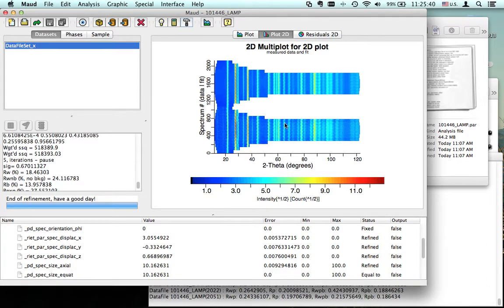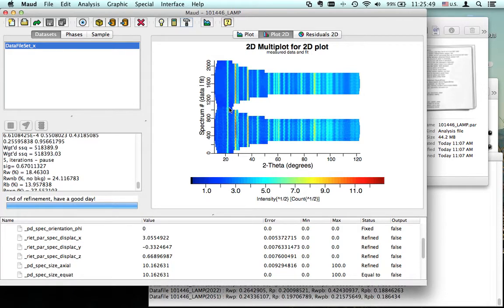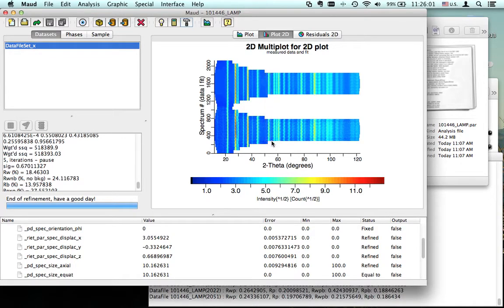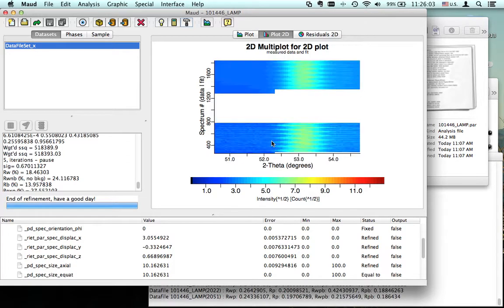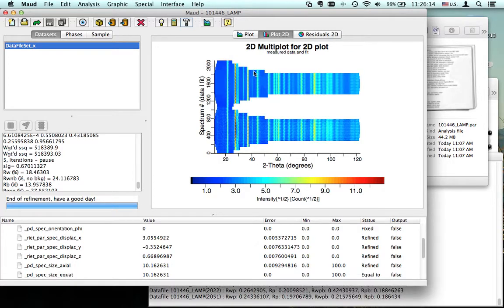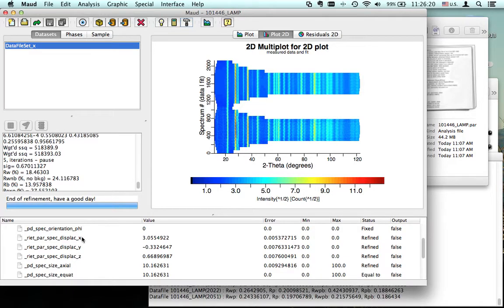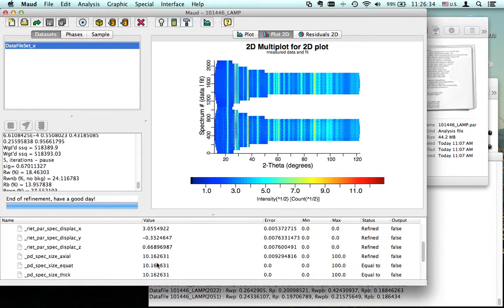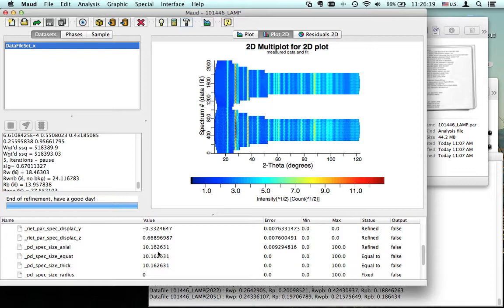It's sufficiently good because we have nearly one thousand patterns. If you check over here, let's check for the waviness. Now you see that we are correcting exactly for the waviness, and even the out-of-sample is going a little bit out. If you look at the final parameters, there was a big displacement, especially in X of the sample—3 millimeters, so this is quite big—a little bit 0.6.